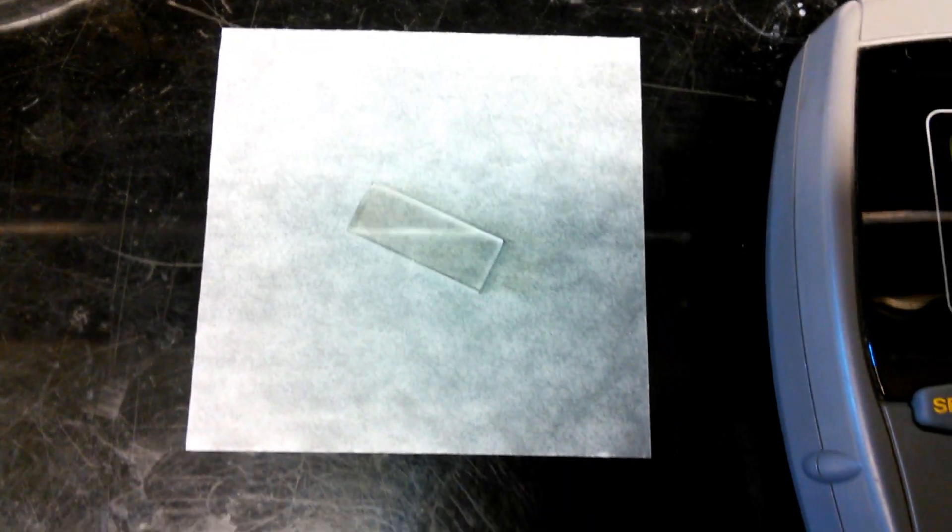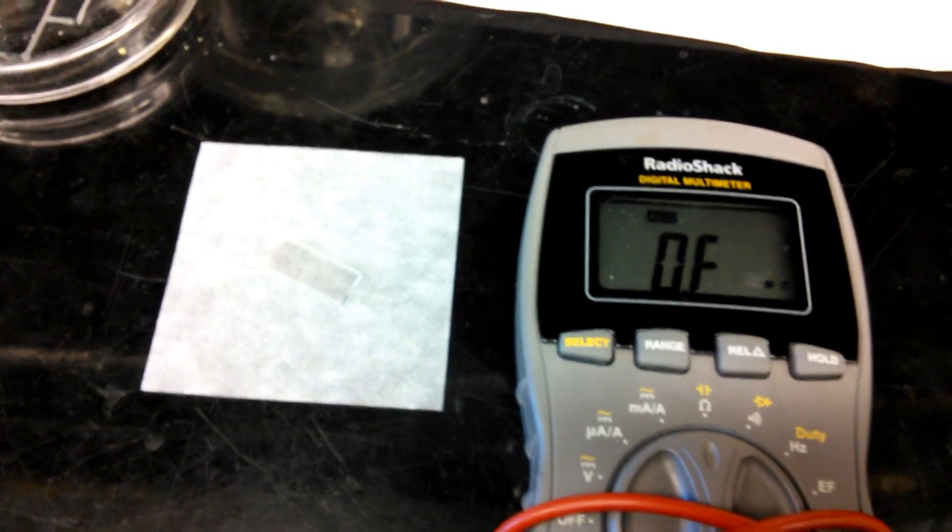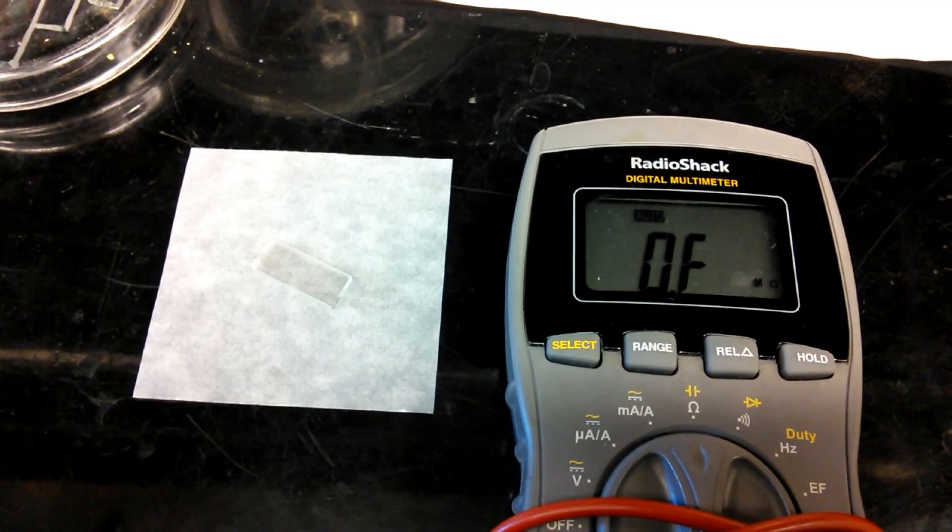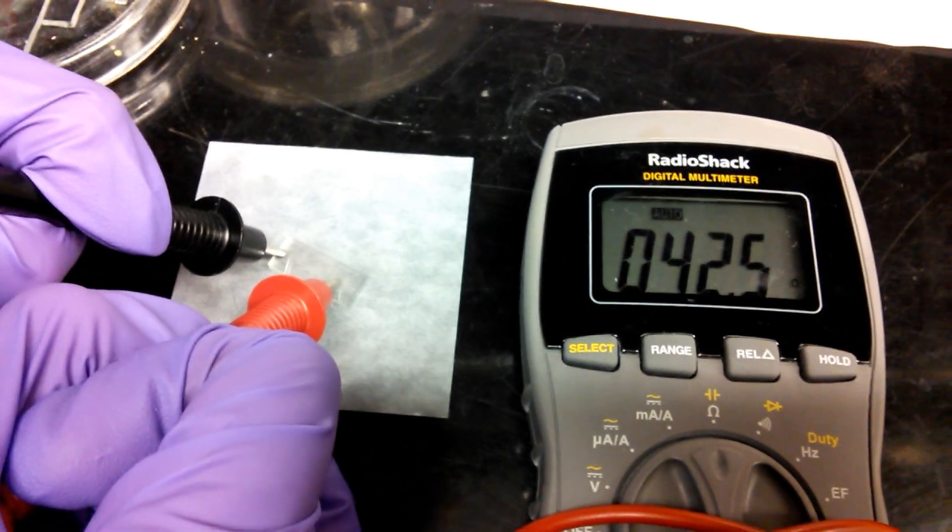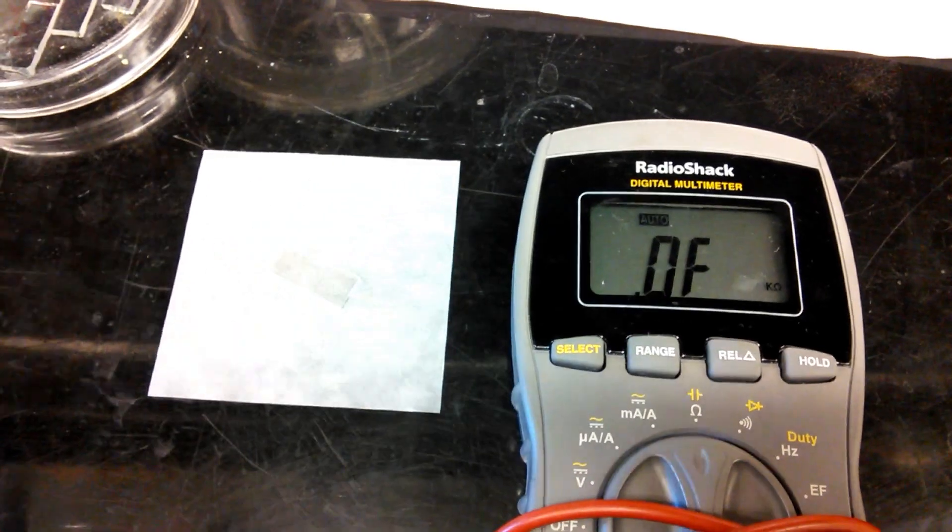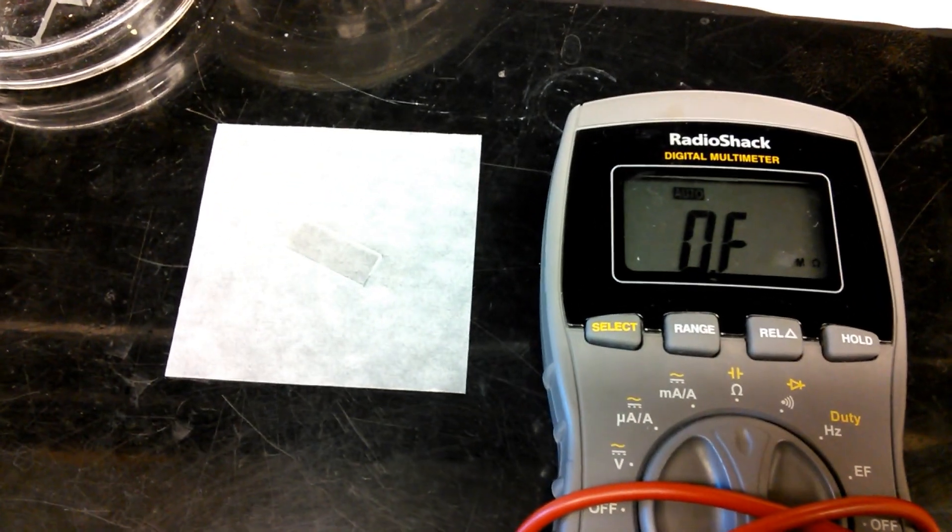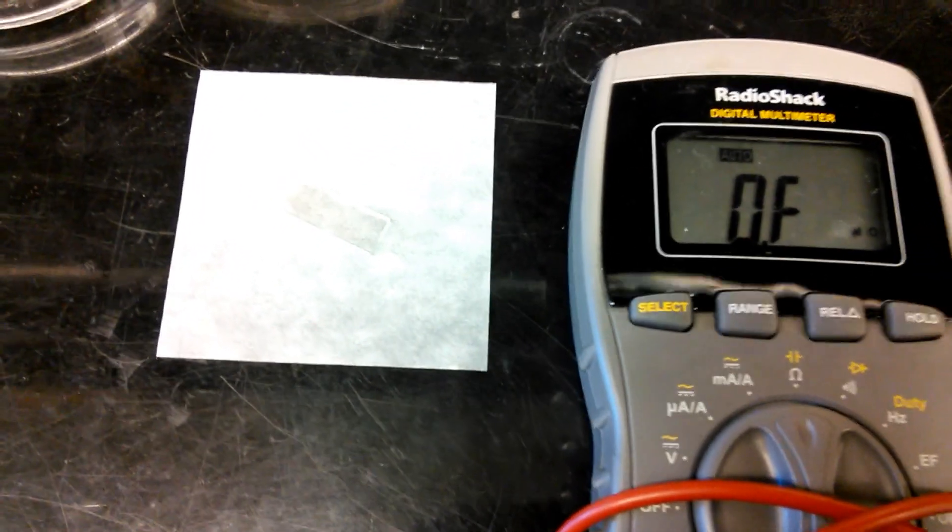Only one side of our substrate, the FTO side, is conductive, so we use a multimeter to determine the conductive side. We then make our films on the conductive side of the substrate.